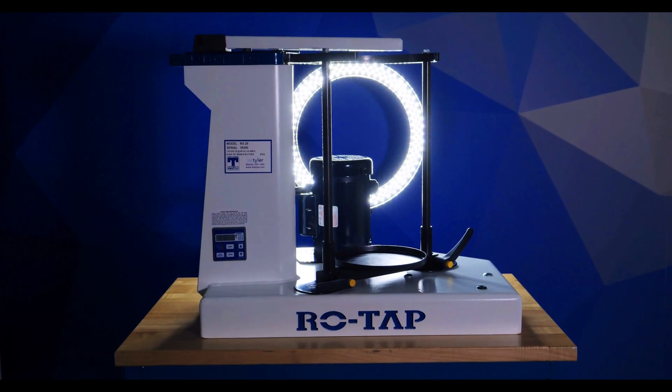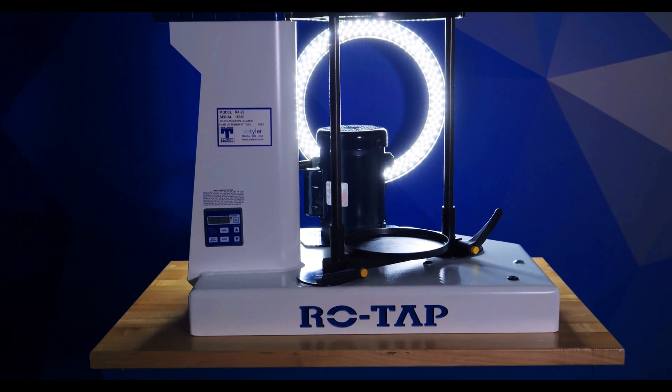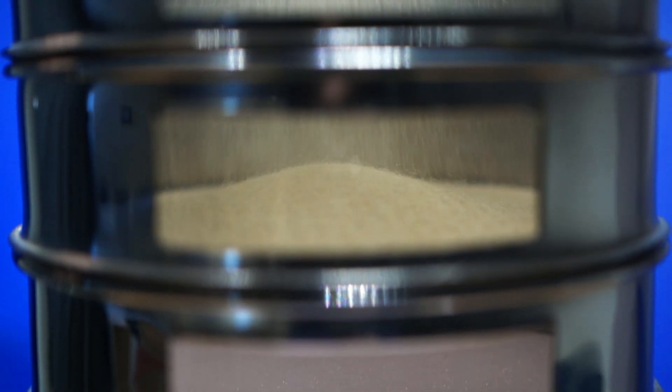The WS Tyler ROTAP RX29 is WS Tyler's signature mechanical sieve shaker that performs dual oscillating and brute force hammer tapping motions to separate the individual particles in a test sieve stack. Basically, it's a device designed to agitate the particles on your test sieve to draw a dependable particle size distribution curve.